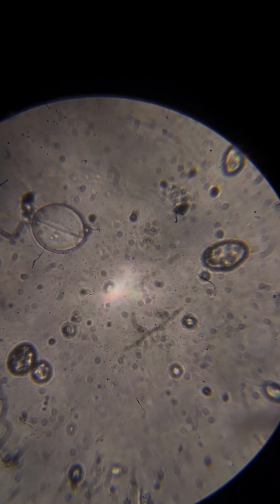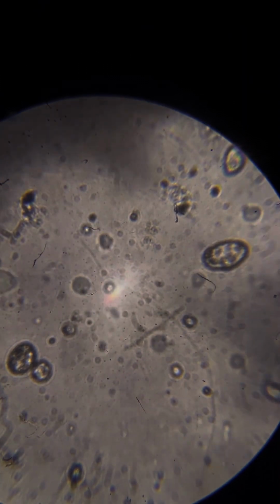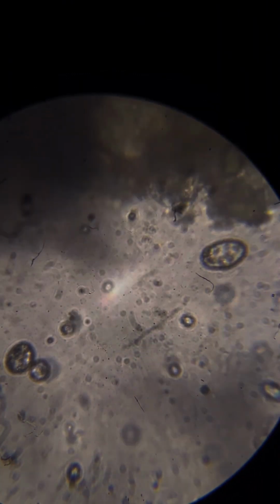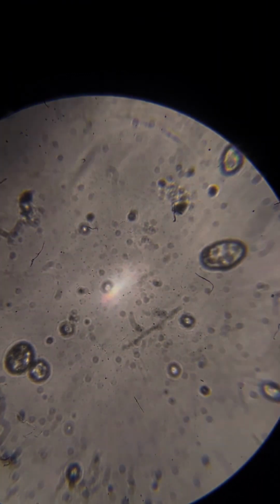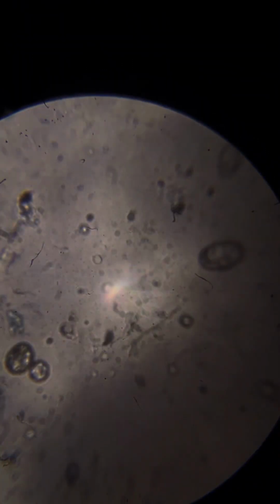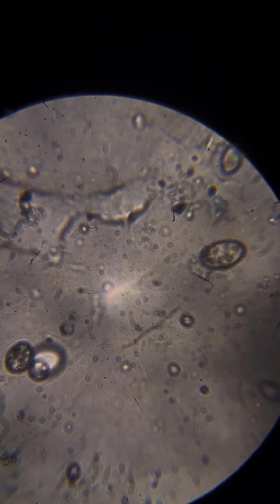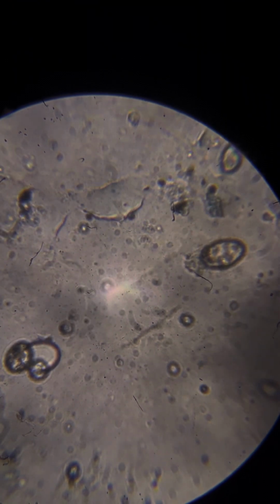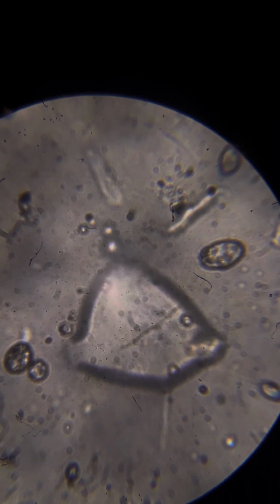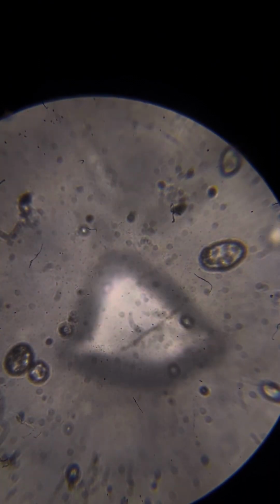This is perfectly normal. You also see that the lens is dirty, but it's very easy to separate what's on the lens from what's on the slide, because what's on the lens doesn't move when I scroll the slide. But yes, I need to clean it. I cleaned it a while ago, but it's always getting dirty because the whole room is very dirty. Unfortunately, I don't have the conditions to work rigorously.